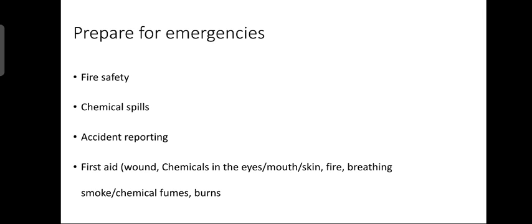In case of a thick smoke filled room, do not walk. Instead, crawl with a wet cloth covering nose and mouth. If fire breaks out close to a flammable gas supply or close to an electrical power source, turn off the gas supplies and electrical power sources. If a solvent in a beaker catches fire, covering the beaker and depriving it of oxygen can extinguish the fire more easily than using a fire extinguisher on the same beaker, which may cause the solvent to spill, thus increasing the hazard.